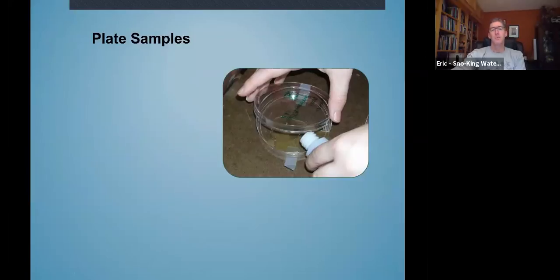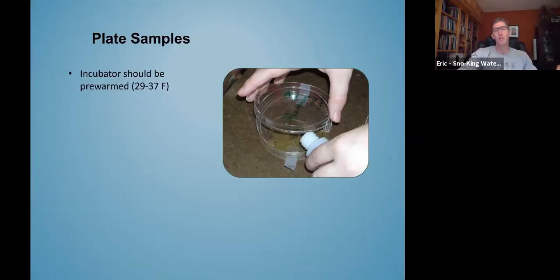So we bring our sample back. Now we're going to do what's called plating. We're essentially going to pour the sample into the Petri dish, and we're moving to a slight change from what they used to do. We used to plate the samples and let it gel, because they're pre-treated with something that will cause the sample to gel up, then put it in the incubator. Now we're essentially just plating it directly in the incubator.